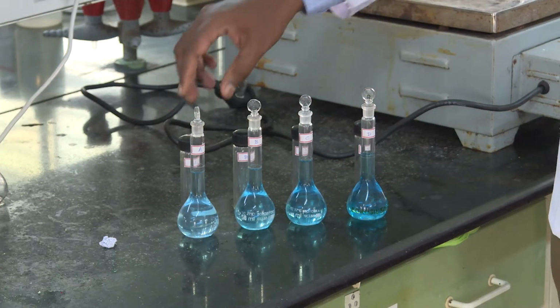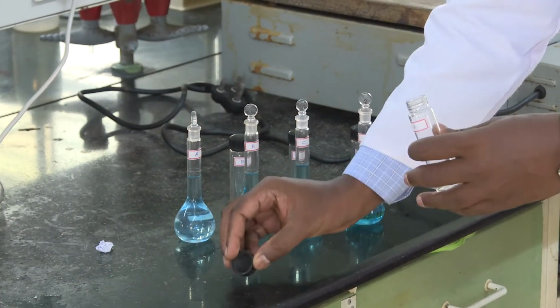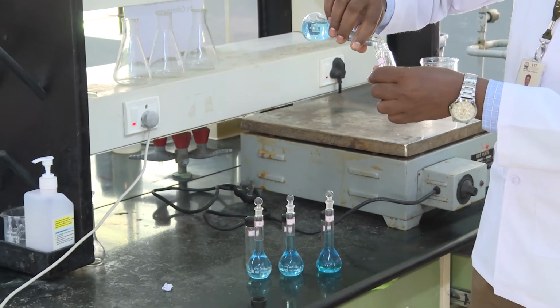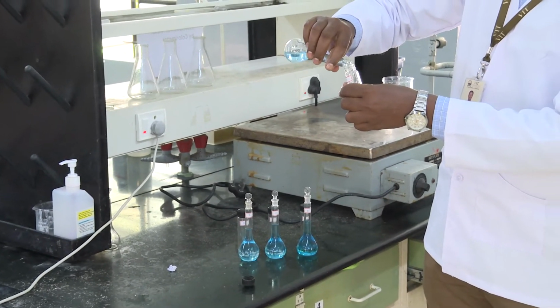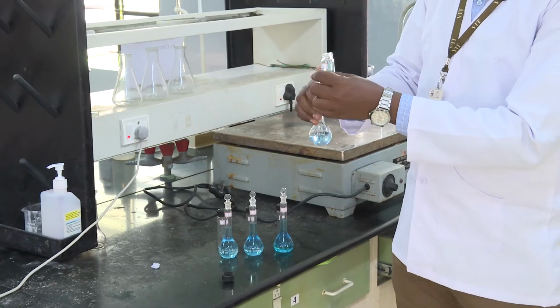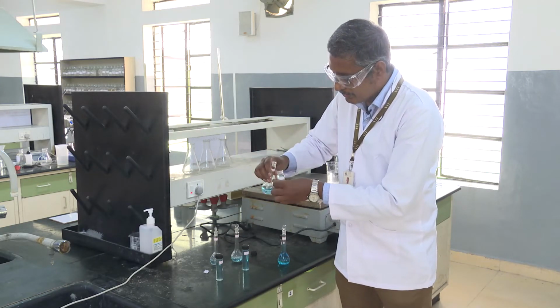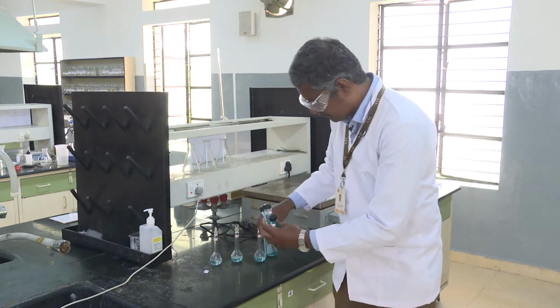Okay, let's transfer the solution A to the glass vials or glass tube, because this solution also needs to be heated in a water bath. So in all of these samples we are using 0.01 molar solution of sodium hydroxide.